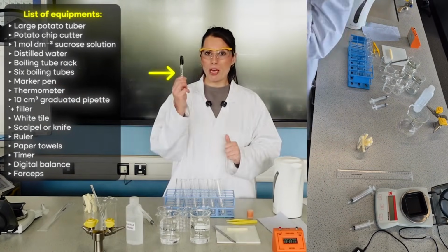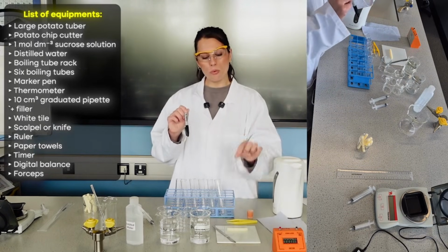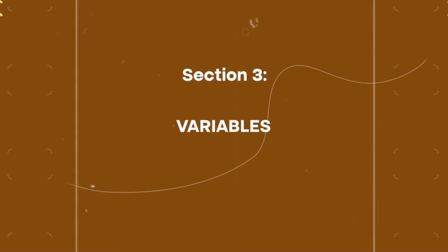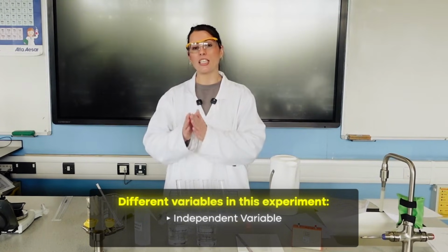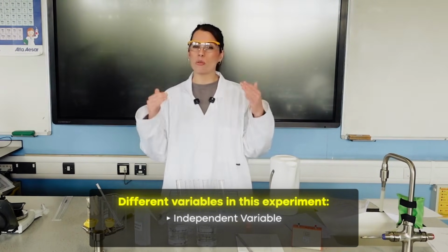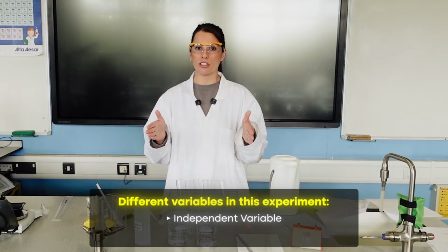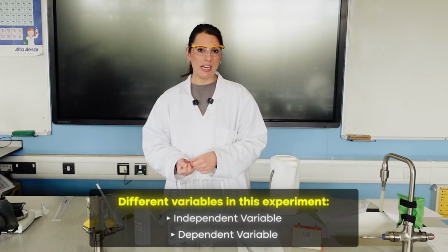And lastly, I've got my permanent marker to label all of the boiling tubes so that I don't confuse which potato has gone into which boiling tube. So the different variables in this experiment: the independent variable is the sucrose concentration, which we are deliberately going to change. We'll need to do that first. We'll need to create our dilution series to get those different concentrations.